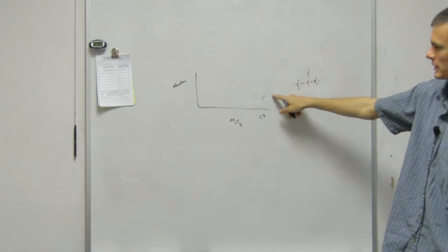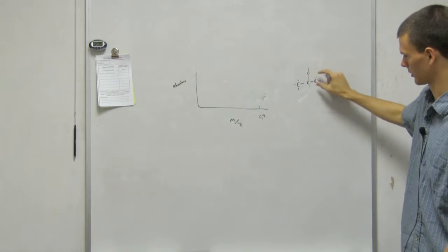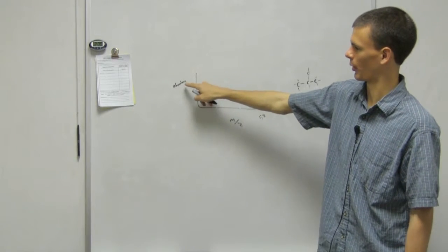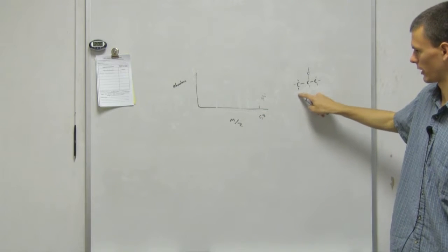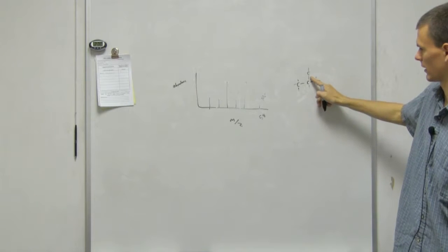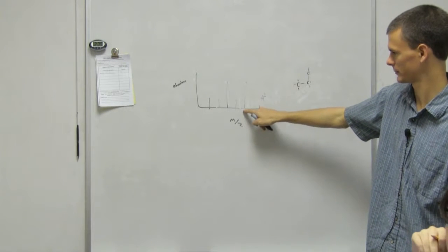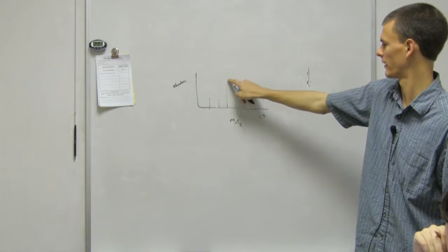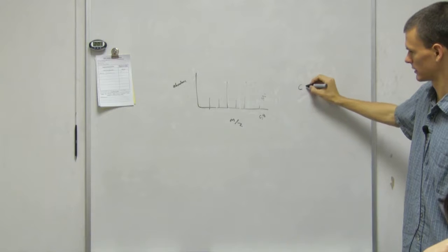What a mass spec does is take this compound and put it through a machine that basically tears it into little parts, and then gives you the mass of each of those parts and their relative abundance. The heaviest peak, furthest to the right, is always the molecular weight of the entire molecule. The smaller peaks are fragments. Say it got cut right there. That piece weighs less than the whole molecule, so it's probably right there, and it might be the tallest. If we lose another chunk, it puts us right there. It could lose this carbon and just be an OH. Each of these peaks represents a fragment of that molecule. Does that make sense?